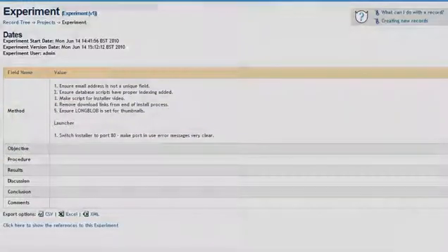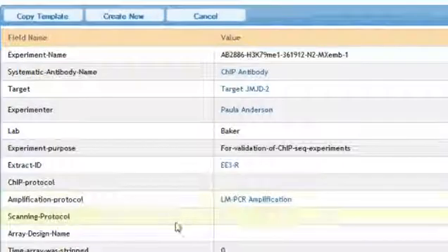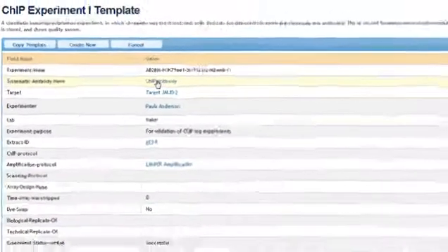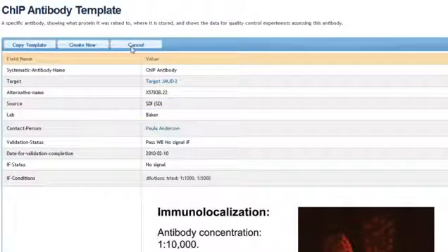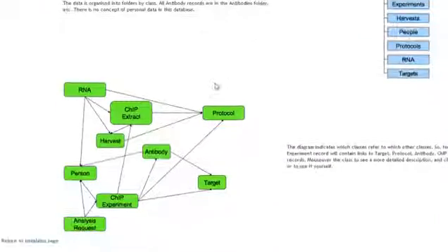You can get even more value from eCAT structuring capabilities through linking between records. For example, if a set of experiments use antibodies that were also in eCAT, the experiments could refer to the antibodies in which they were used, and it would then be possible to find the antibodies used by an experiment when viewing the experiment without any duplication of data. In the visualization appearing on the screen, you can see how one group of labs using eCAT has used this to build an entire interlinking database of interlocking records. That's become an incredibly valuable tool, which helps them to conceptualize their research and organize their research data.